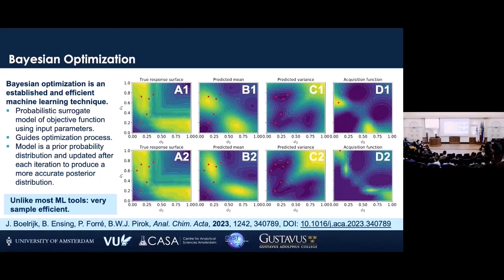So then it is added over here. So now we have 6 data points, and now you see that the surface looks already a little bit more like it. And like this, it's adding points until it basically has an identical surface. Of course, it never knows this, so it should technically be able to continue forever, but yeah. So this is how it works.